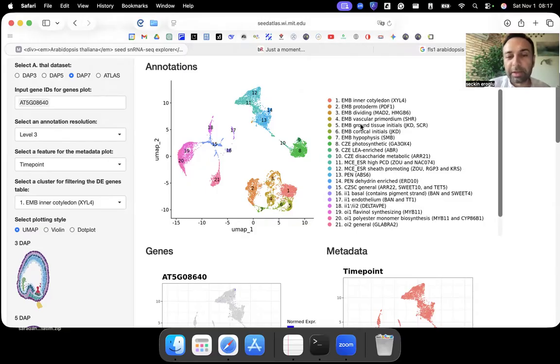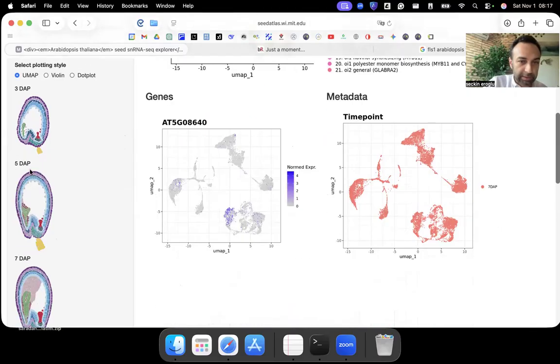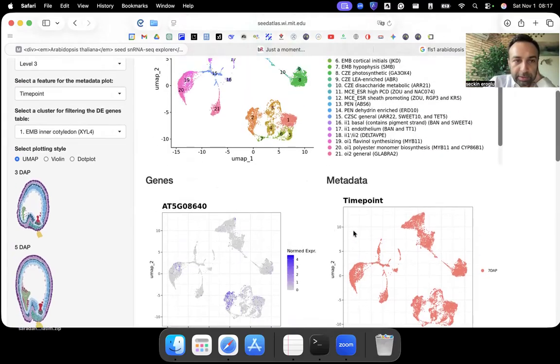So what you can think, since this is responsible for synthesis of flavonols, for example, quercetin, then I can immediately hypothesize in the growing embryo, I should have quercetin in the very outer part of the embryo, not inside. Why? Because the gene is mostly expressed in the outer part. Of course, this can change as the days change. Like in 9 days after pollination, maybe it changes. Okay, so this is how to use the thing.